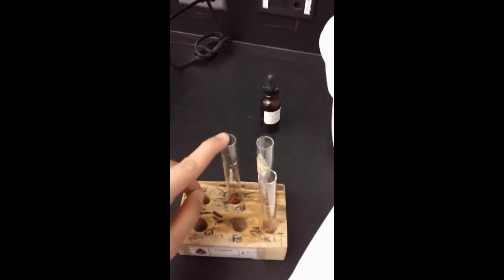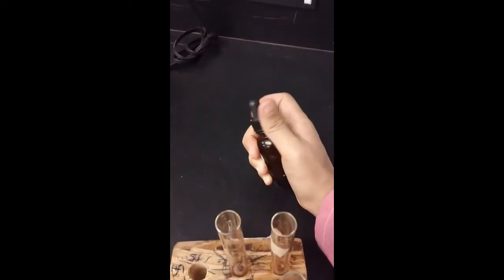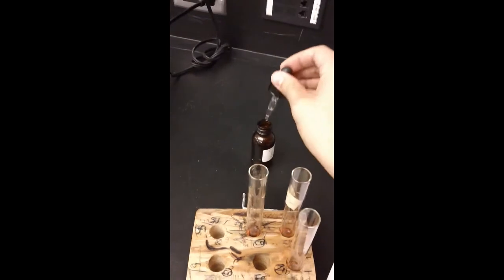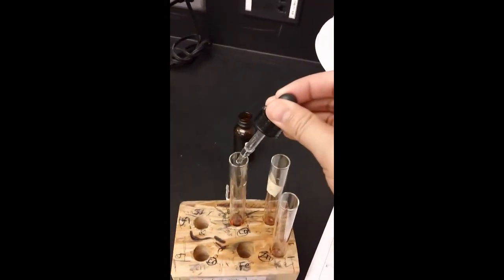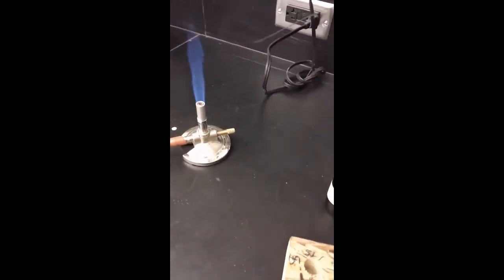So here I'm running the flame test first, so I'm going to use test tube A for flame test A. So what I want to make sure is I follow all the directions for flame test, but since we've done it once, I'm going to kind of speed through it for us. Remember not to add chemical to all of them, just to the one that's going to be used for test A. Now I've done that, I want to clean my rod. Good. Now I'm going to put it in here, test A.